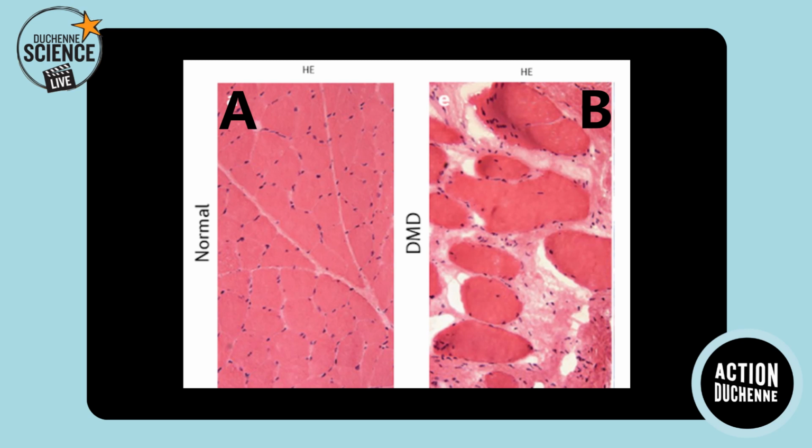They are regular in shape. They are regular in size and number. And in the middle, the white arrow points to a white line, which is basically connective tissue. So you can see a nice distribution of connective tissue, and you can see equally distant sized cells, and a nice distribution of cells in number.